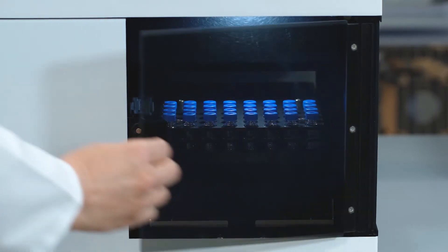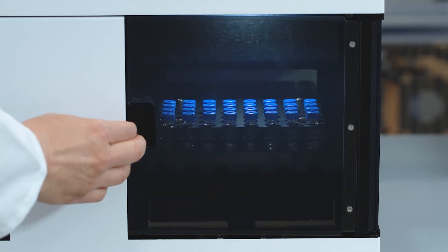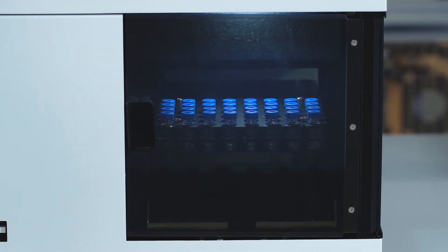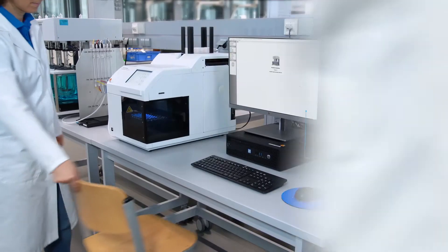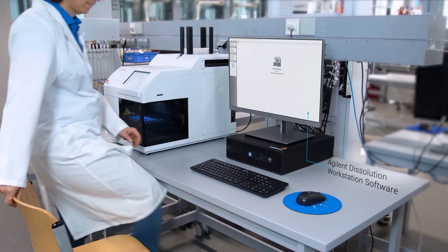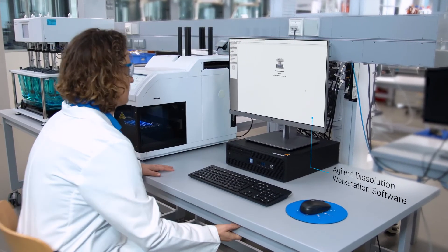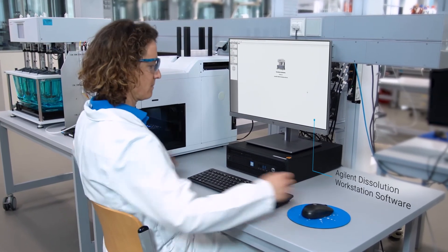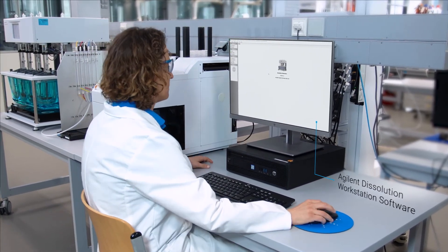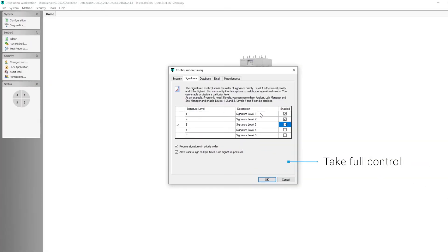The complete automated workflow is controlled by the Agilent dissolution workstation software. The software allows for individual user accounts and access rights.